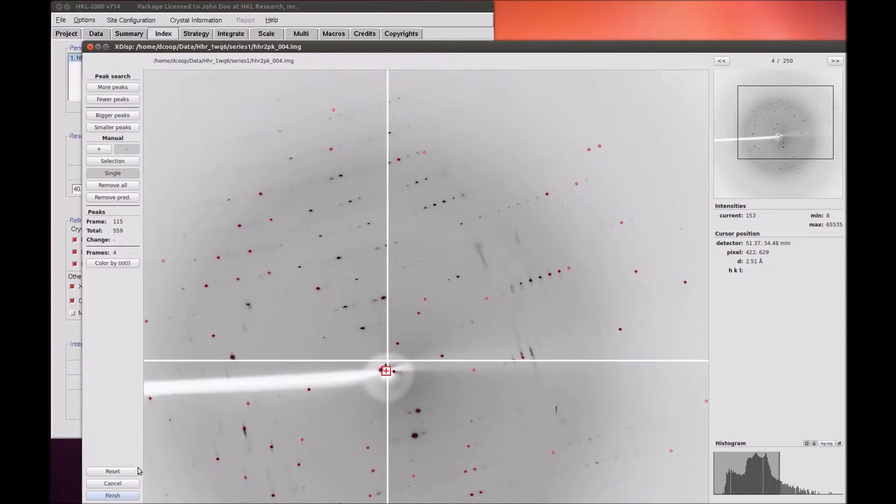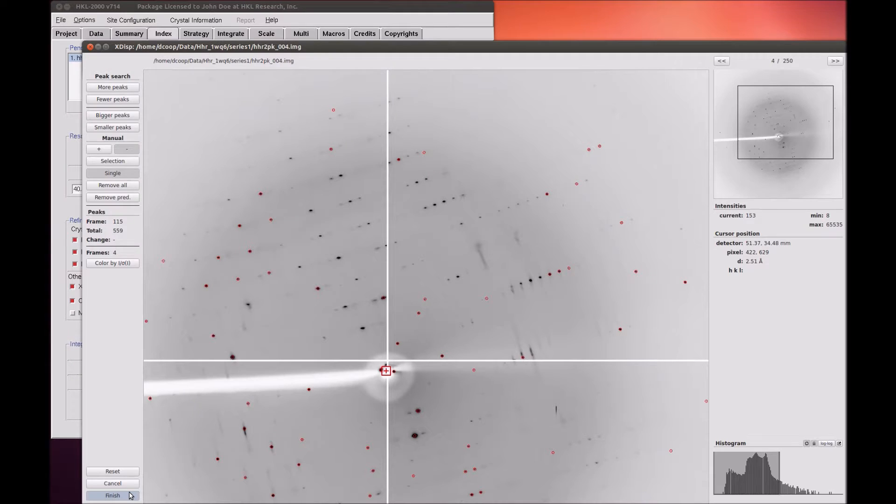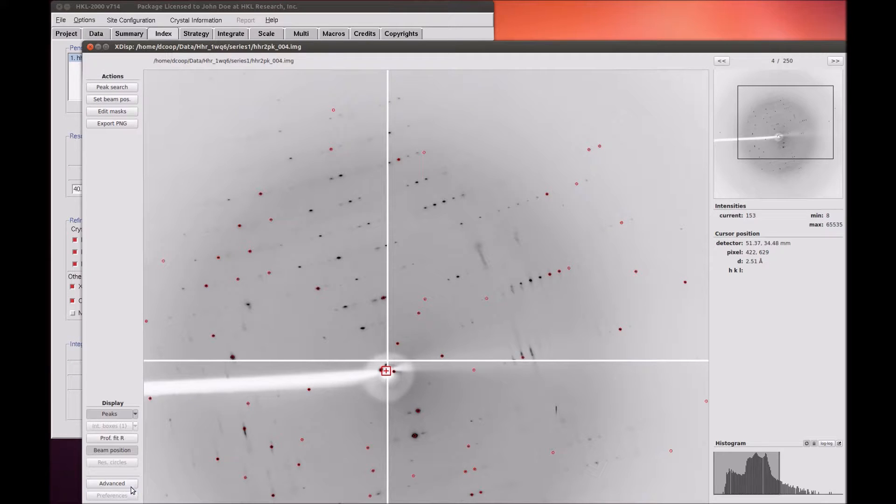Reset, Cancel, and Finish buttons are located at the bottom left. When performing a manual peak search, it is important to click the Finish button to save the peaks to a file so they can be used for indexing.